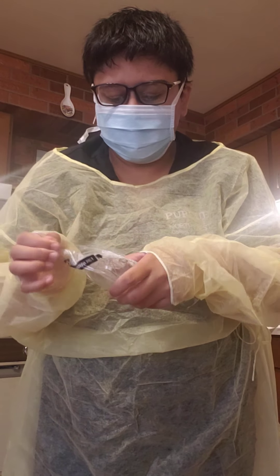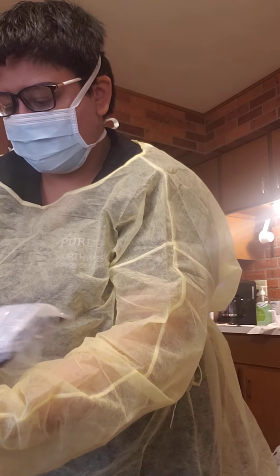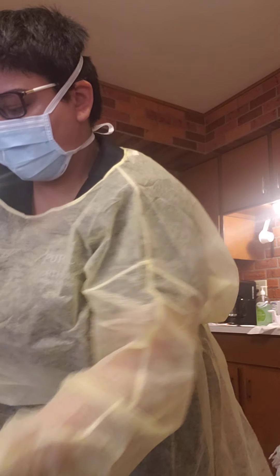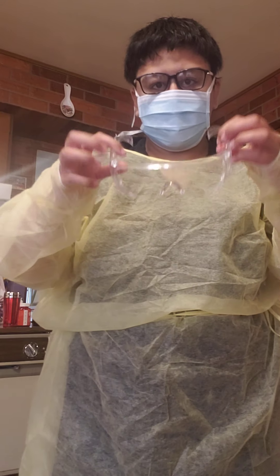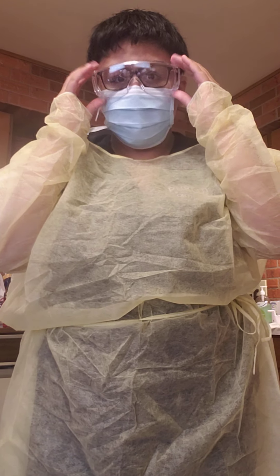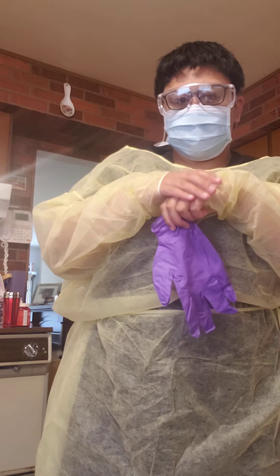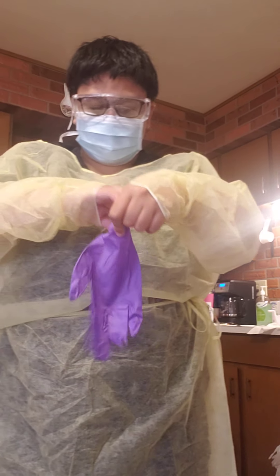That's now secure. Next I'm going to put on my goggles. And then next I'm going to put on clean gloves over the seams of my gown.